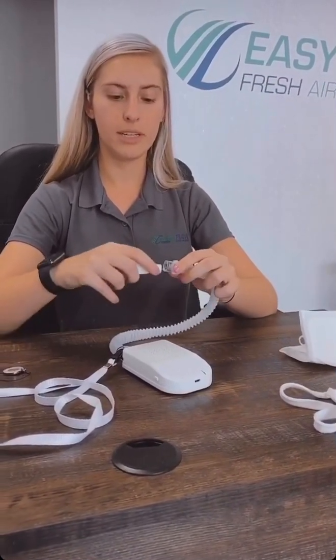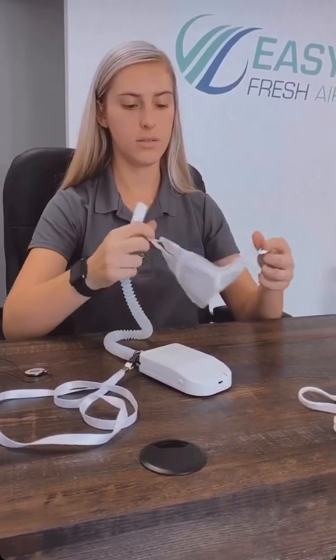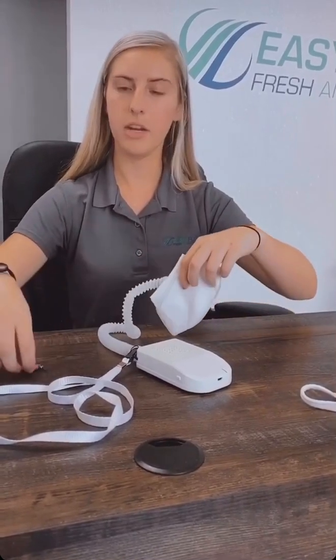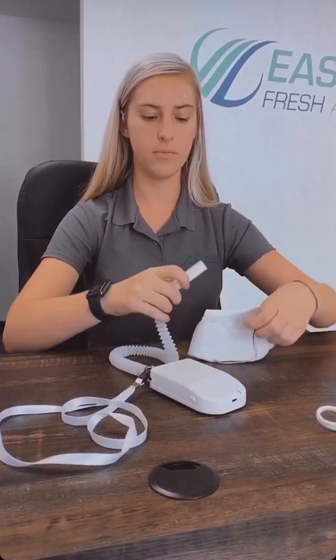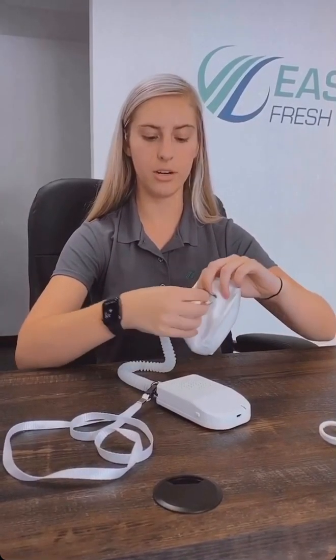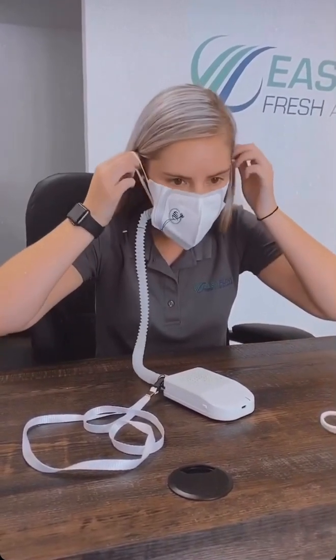A lot of ways people like to connect without cutting a hole is doing the magnet air nozzle option. So you just connect your air nozzle, run it through one of the ear loops, and then you just use the magnet to hold it in place. What you can also do on this string is pull your tube through it, then put it through the mask, and then put it on here, so if it falls off, it's not going to fall into the ground. Then you just put on the mask, and you're ready for use.